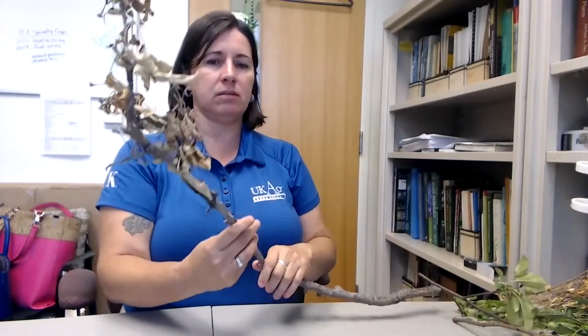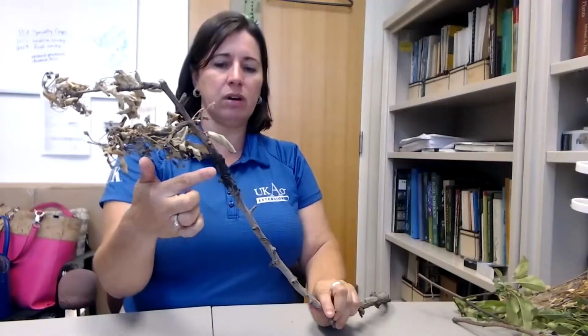In regards to cankers, you've got to be able, let me see if I can get a sample here. You've got to be able to find a margin that is going from, I don't know if you can see it. Let's see, let me spin it around. You've got to be able to go not just from the canker itself, but you've got to be able to move back into healthy tissue and find the margin of the canker underneath the bark.